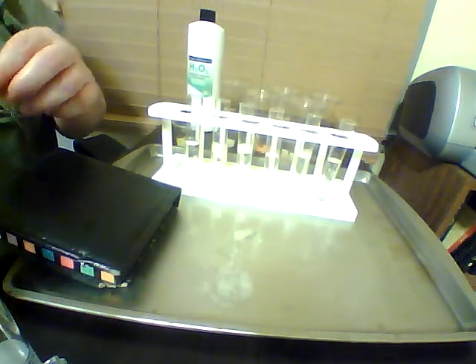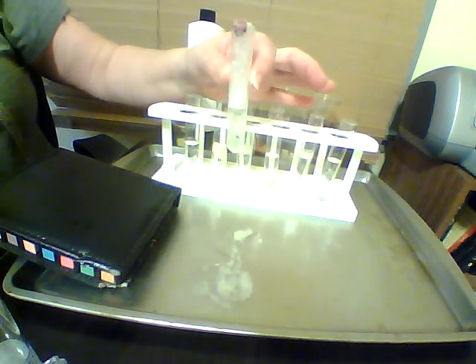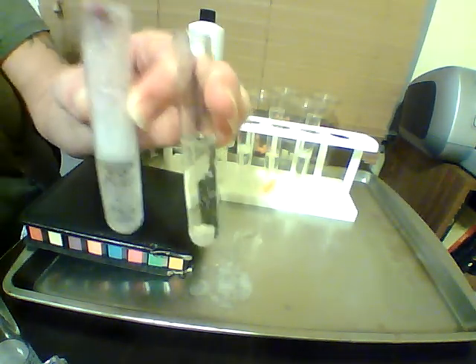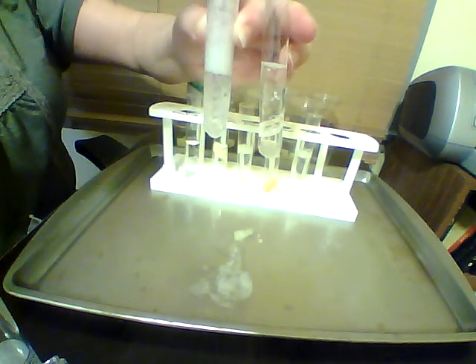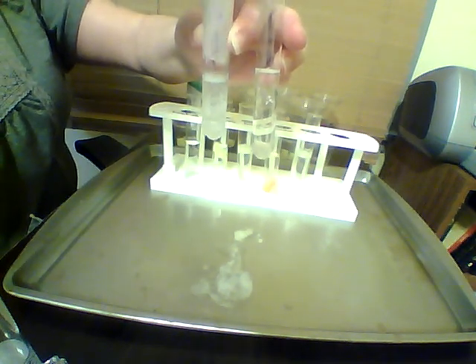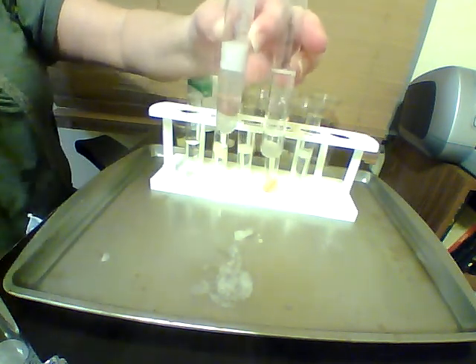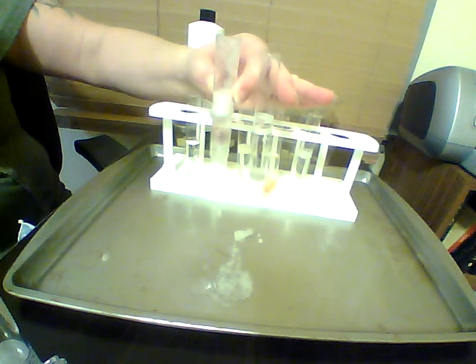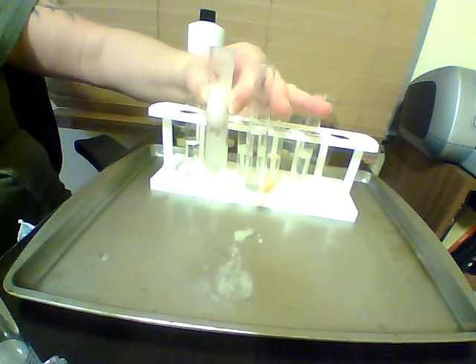And then we have, again, our raw liver, which has pushed the liver back up out of the tube and stopped reacting, compared to our cooked liver. And if I were to take this liver and push it back down into the hydrogen peroxide again, we would see that it's going to continue to make bubbles. And it's filling the test tube back up again.